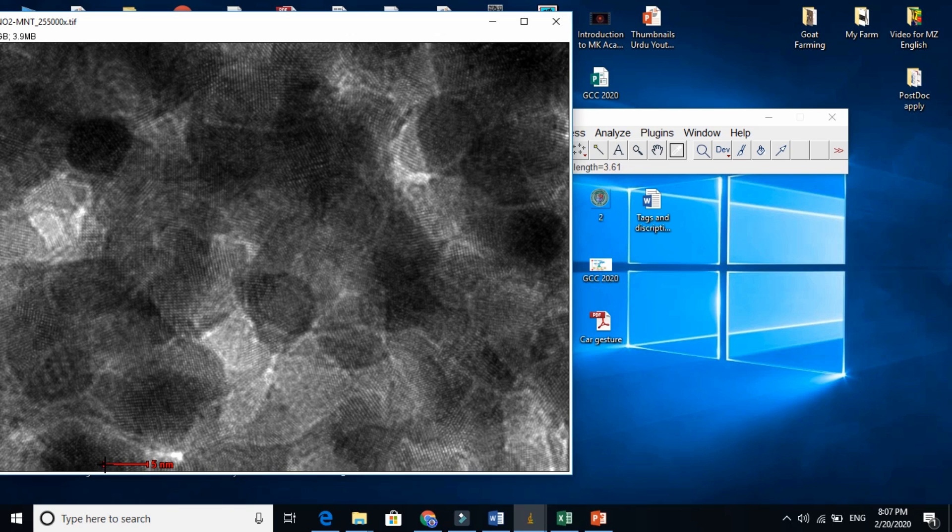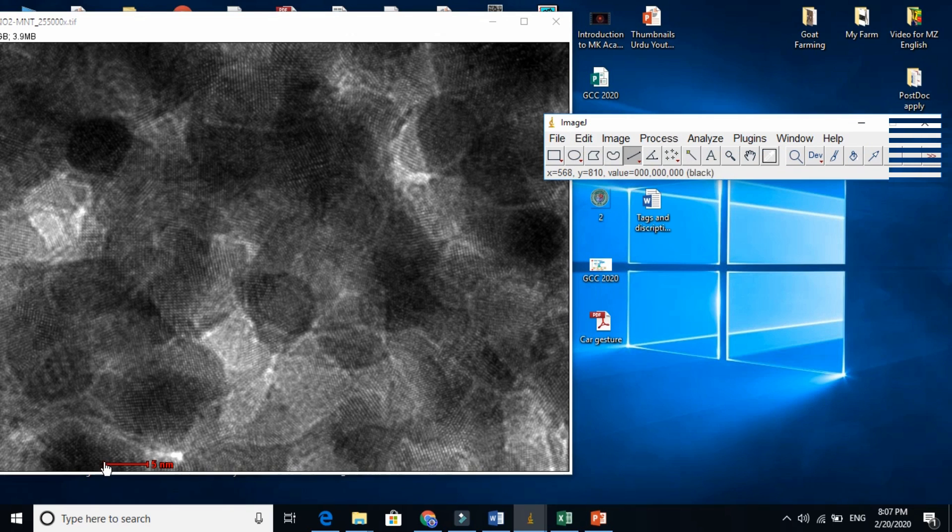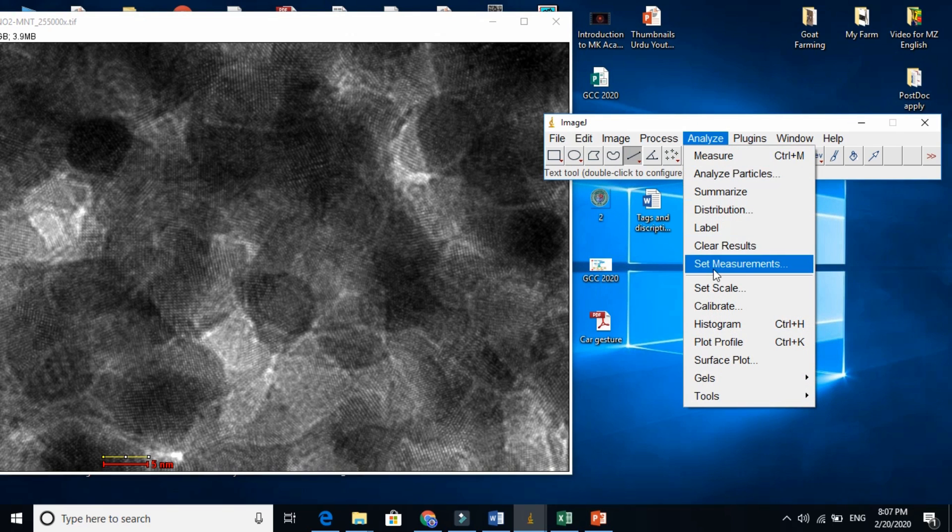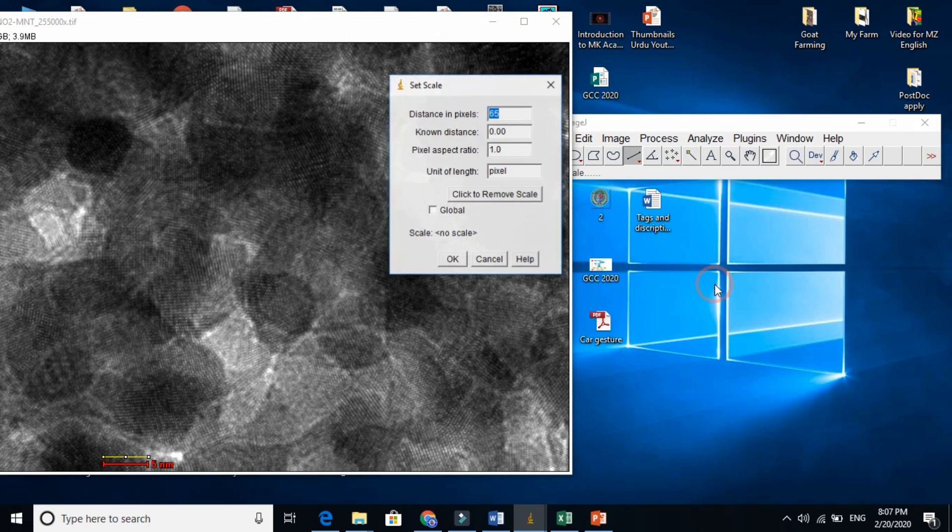And you need to press shift and draw this line here. Draw the line here. Go to analyze here and click set scale here.